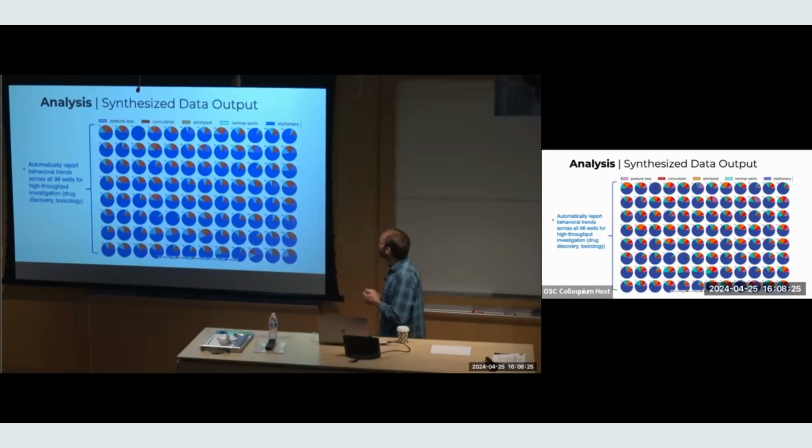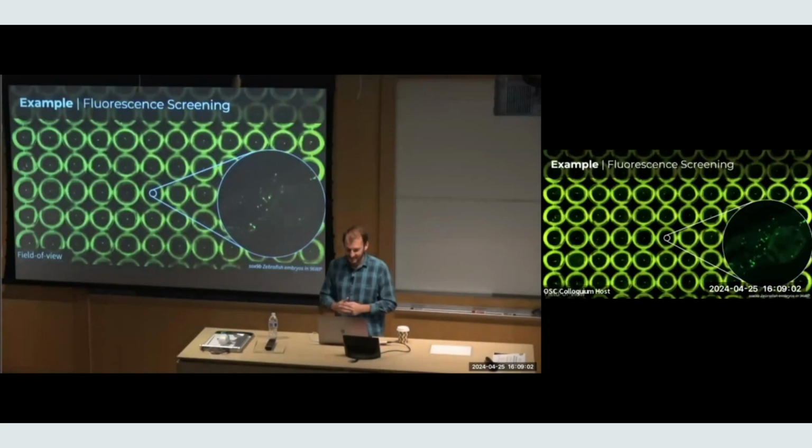And so you can see here, the fish were predominantly stationary, but for example, if a certain zebrafish had expired or was really excited by a drug, then this blue part would disappear and it would become much more colored. Right? And so anyways, this is a long way to say that we're ingesting for this plot probably like 10 terabytes of data. But at the end of the day, all that matters is something like 500 bytes of information. But I guess that's just something we've learned is useful.